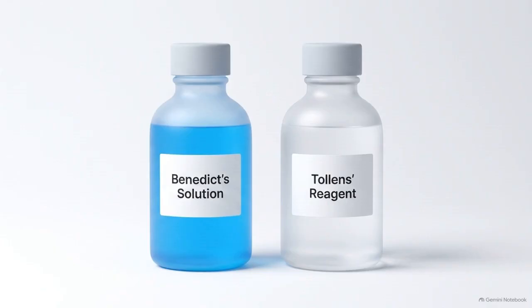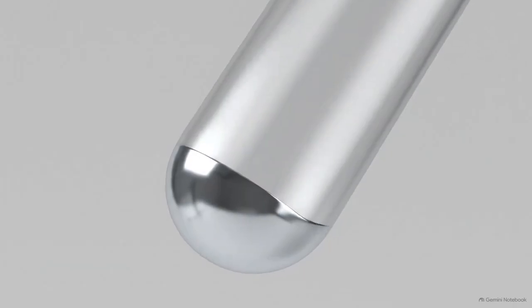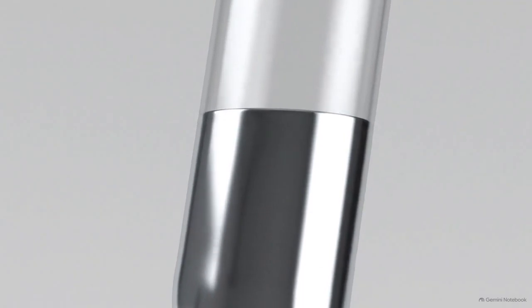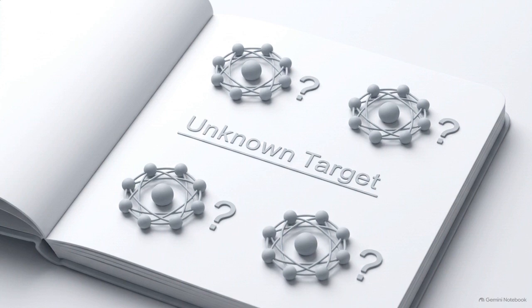Now we measure reactivity. We introduce Benedict's and Tollens' tests to check for a free aldehyde or ketone functional group. If it exists, the sample is a reducing sugar. In Tollens' test, the chemical reaction reduces silver ions into solid metal. A reflective silver mirror rapidly coats the inside surface of the test tube. Between the brick-red precipitate of the Benedict's test and this silver mirror, we have our proof. The sample is a reactive reducing sugar.